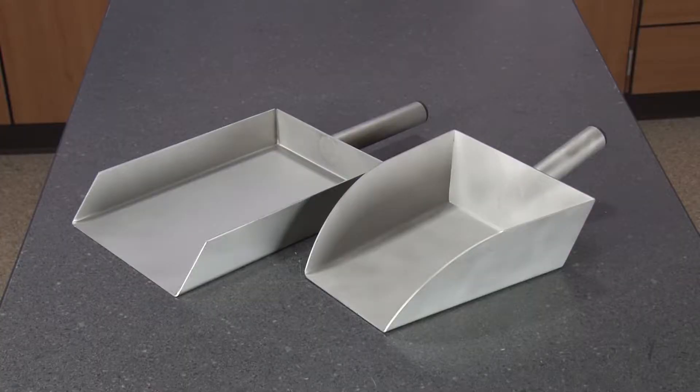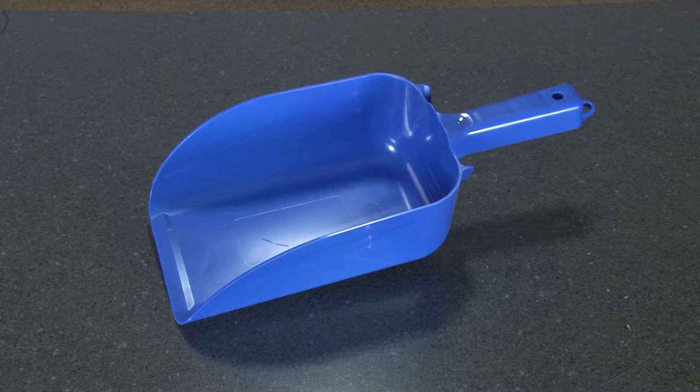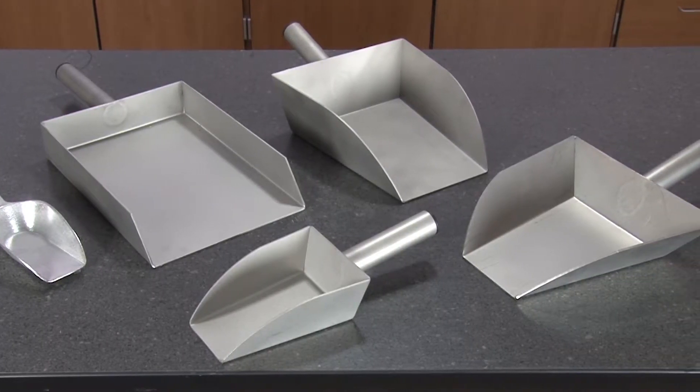Gilson's scoop selection includes models constructed of stainless steel, aluminum, or high-impact brake-resistant polystyrene in many different volume capacities ranging from 2 ounces to 85 ounces.